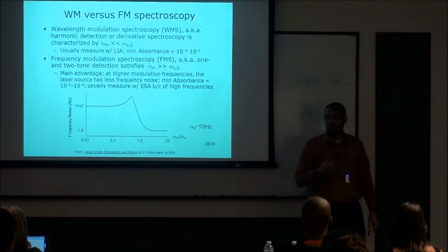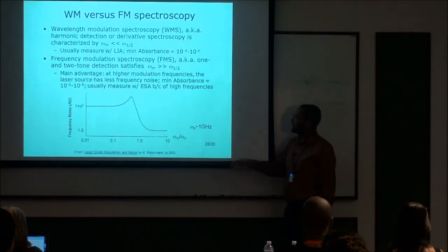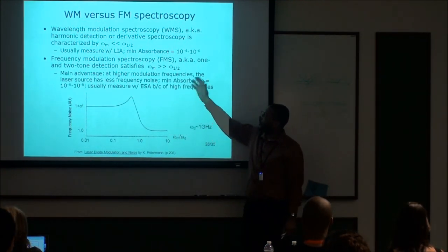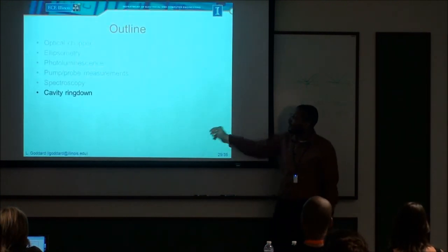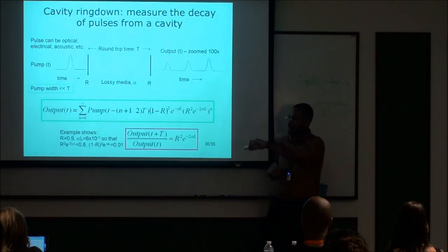So if I do high frequency modulation of the wavelength, then I can get lower noise. So this kind of explains the frequency modulation technique. Okay, the last thing that I was going to cover is cavity ring down.